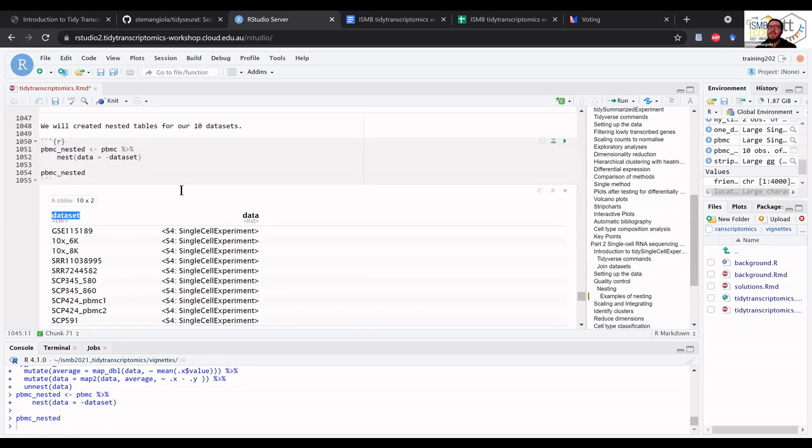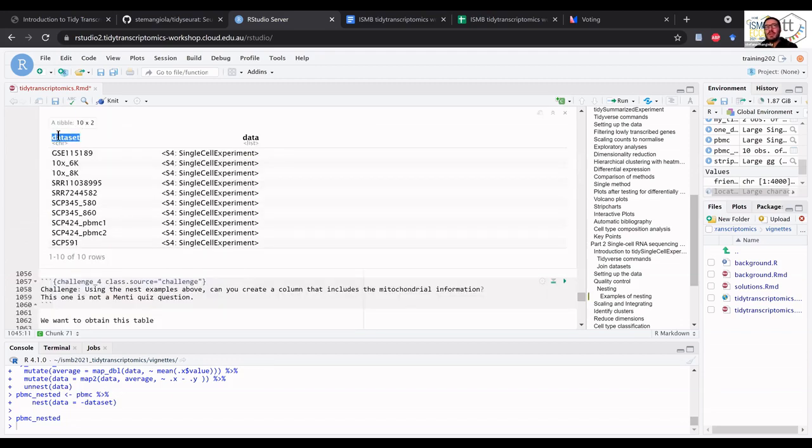And this is really flexible. We could subset our dataset very easily on any combination of any annotation. We can subset on PCA, we can subset on number of cells, we can subset on anything. In this case, we want to subset by dataset because of our quality filtering.